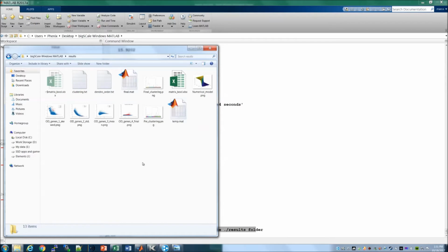Most of these files are for the more advanced usage of bigSCale, which we will cover in the next tutorial. Specifically, in the next tutorial we will explain how to tweak the parameters to adjust the output to your needs, how to remove batch effects, and also how to create iCells to analyze very large datasets of millions of cells.